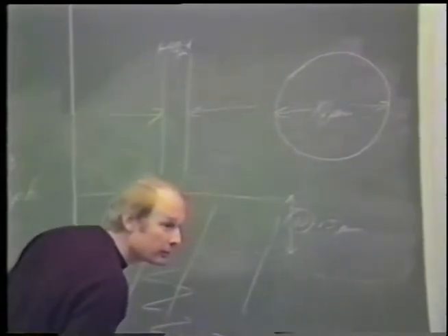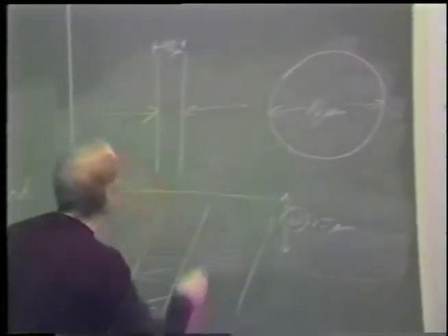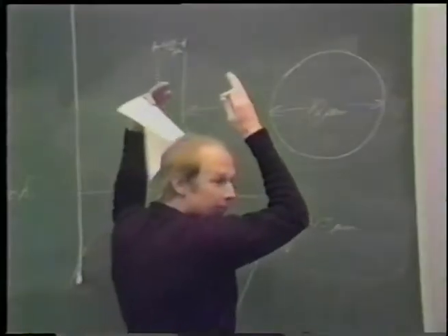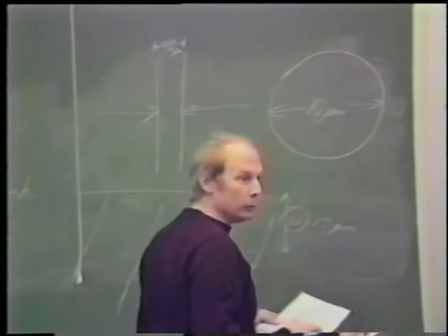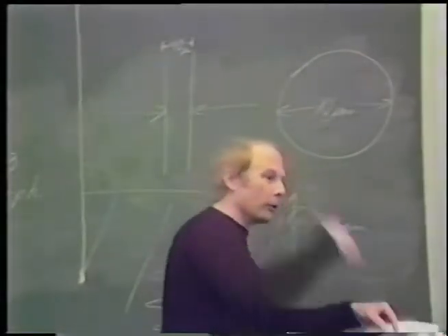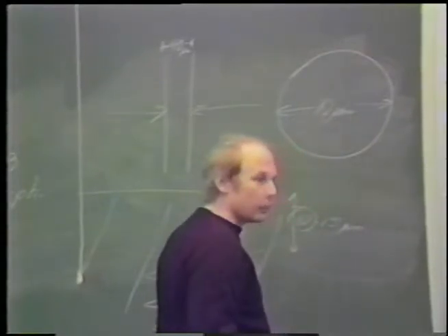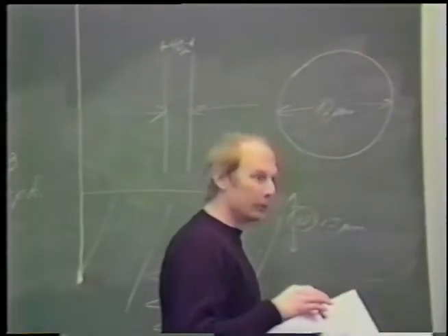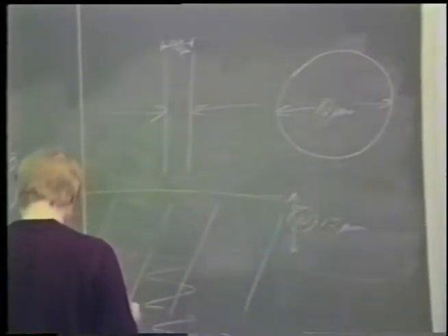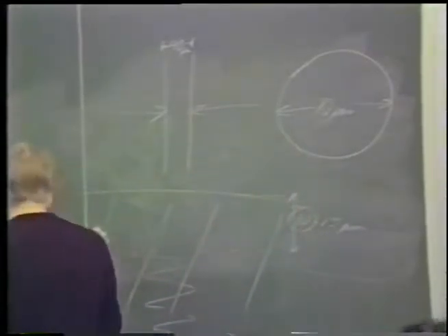Why is spherical 70 when you said 40? So that's for a flat slab. This is for a flat sample that's an infinite slab. And in the sphere you can do better because of the geometry and the fact that you're withdrawing heat uniformly over the entire surface. Okay?